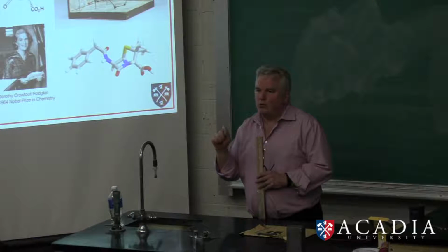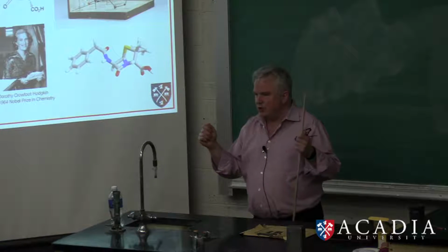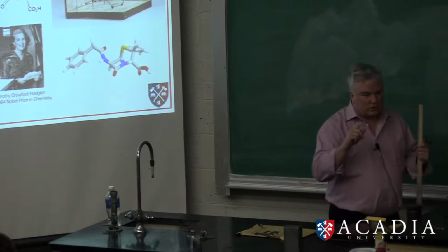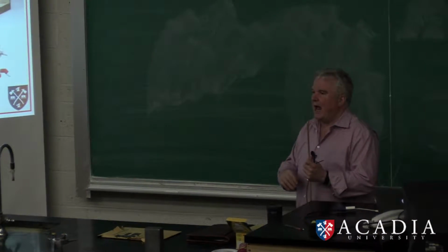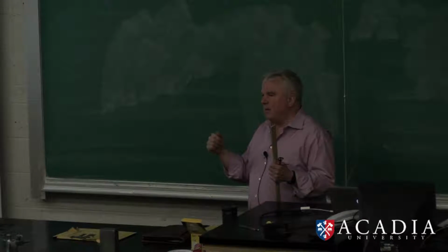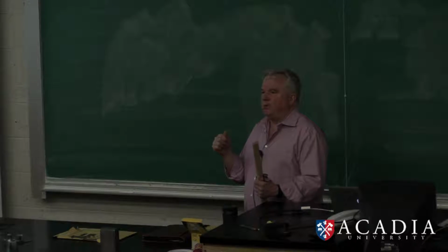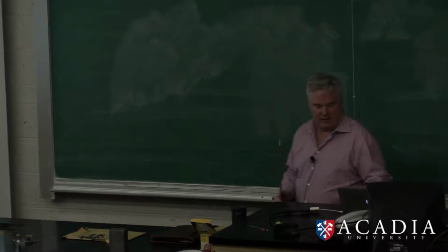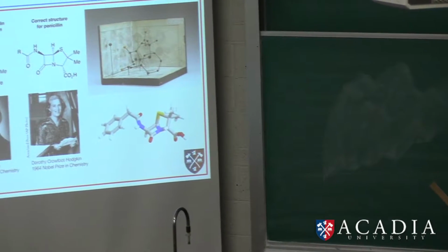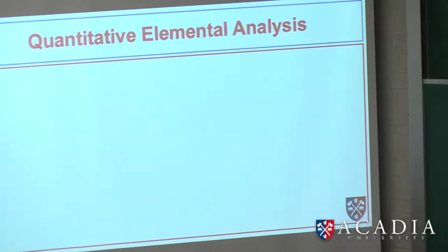You should remember that when we're determining structure, most of the time it's from a chemical reaction where we took the starting materials, so we actually have some idea. Most of the time, when we're doing structure determination, we're actually doing structure confirmation. So when we take molecule A and molecule B and do some reaction that just couples them, we have a pretty good lead on what the structure should be, given our starting materials and the reactions that we used. And that actually helps us when we get back to determining the structure of unknown compounds.